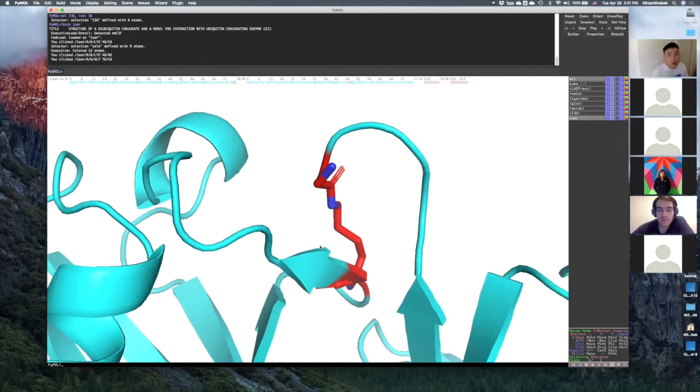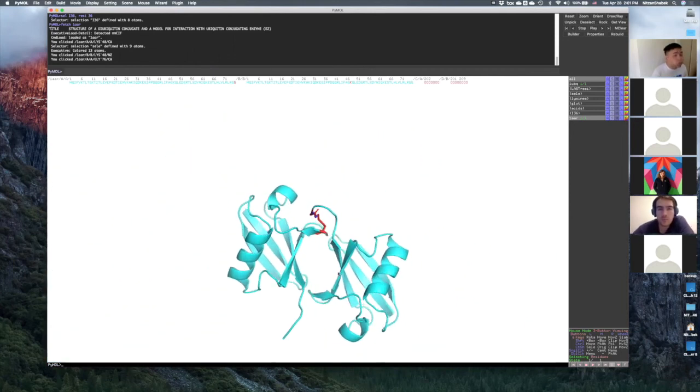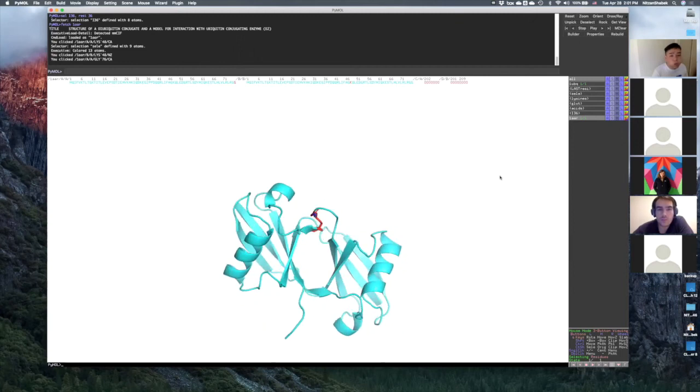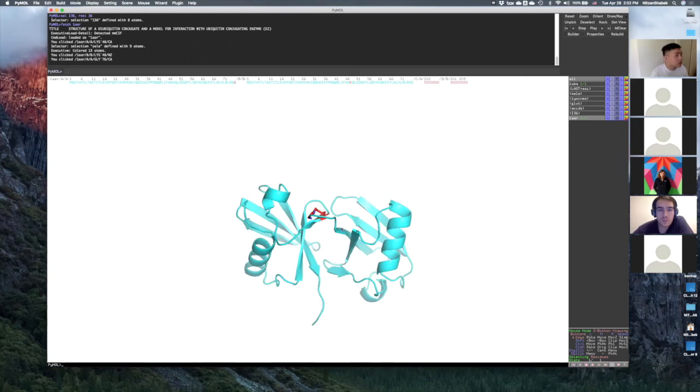Okay? So, you can imagine that this is just the first two ubiquitin, but then again, the ubiquitin chain will build up, and this is going to be where it's going to bound the substrate, right? So you have the first here going to be the target, and then you have the polyubiquitin chain. And this polyubiquitin chain will have a really interesting surface that can be recognized by the proteasome, okay?